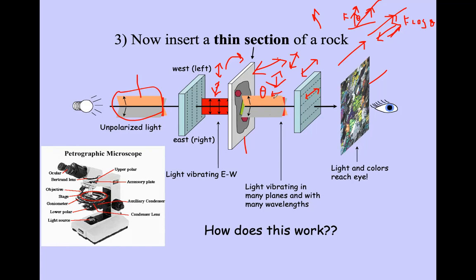But here you are filtering it again, a kind of filtration, so you will not get the real frequencies out from the second polarizer. Therefore you will see vivid colors here, not the exact natural color. These different colors are a result of the second polarizer. We will discuss this phenomenon later on. Anyway, these colors are important.